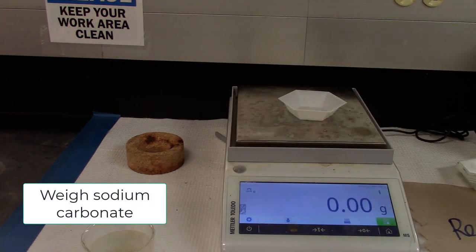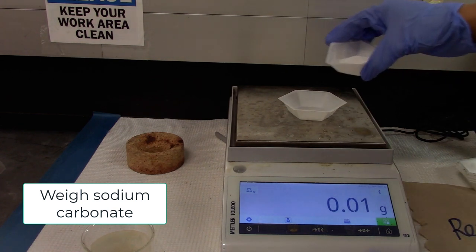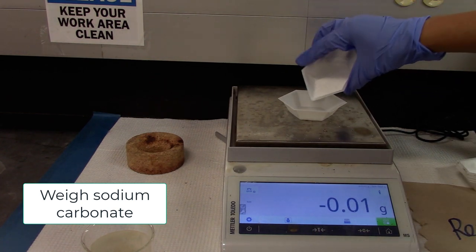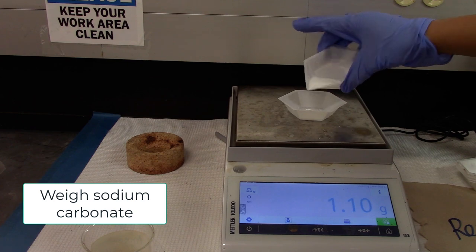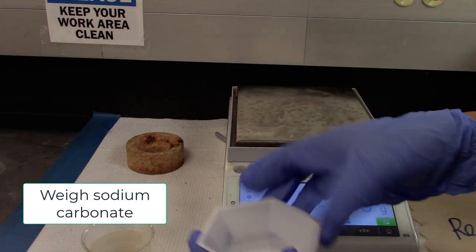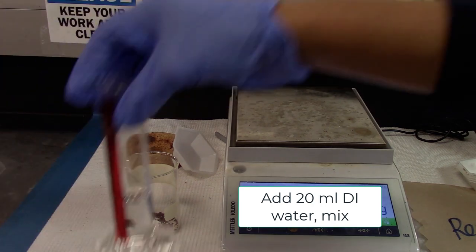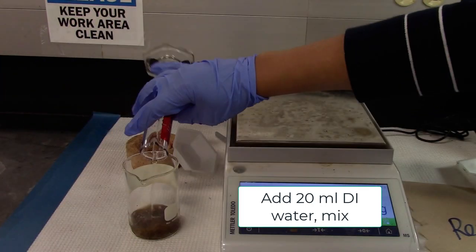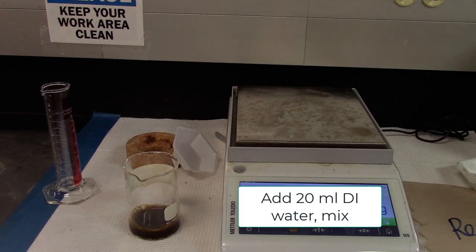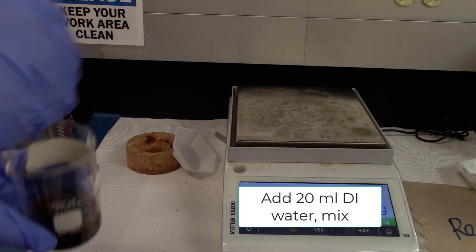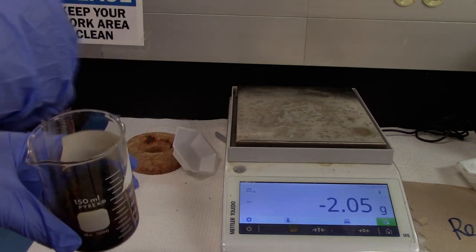We would add about 1 gram of sodium carbonate to this instant coffee and add 20 mls of DI water. Use a glass stirring rod to mix it.